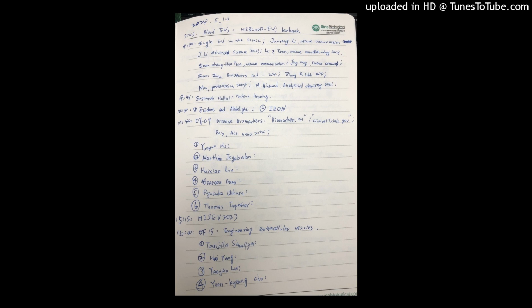In a word, the ddPCR assay is a versatile system for EV subset analysis at the single EV level and has great potential in cancer diagnosis.